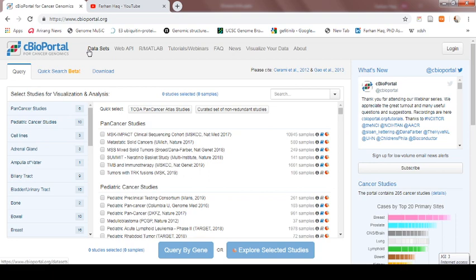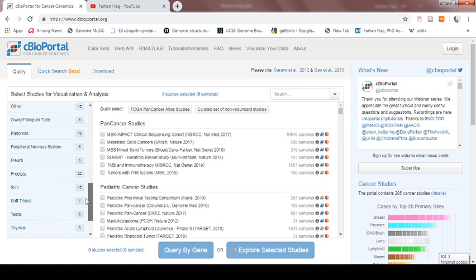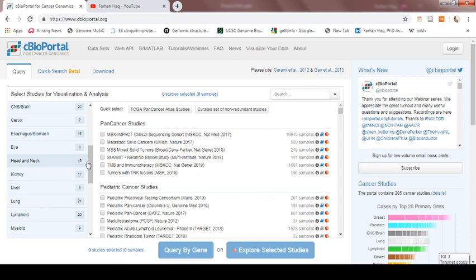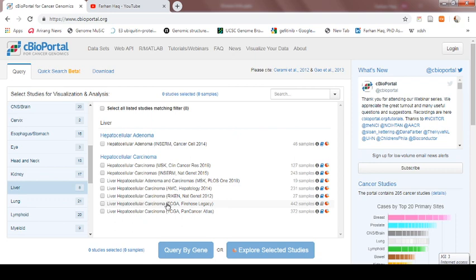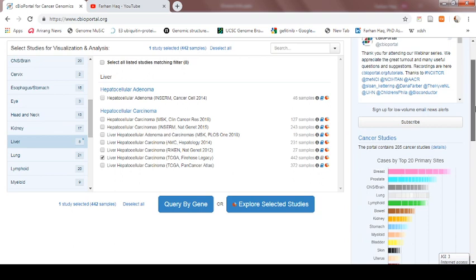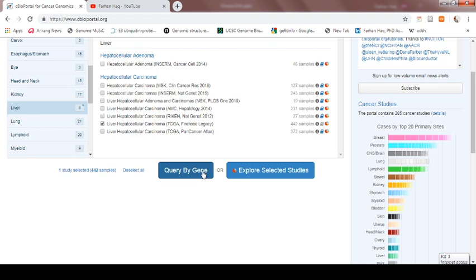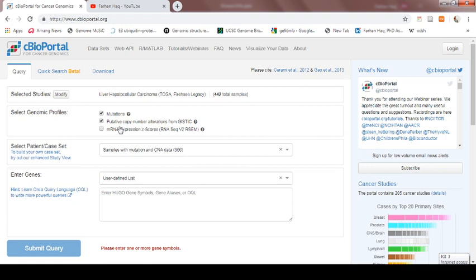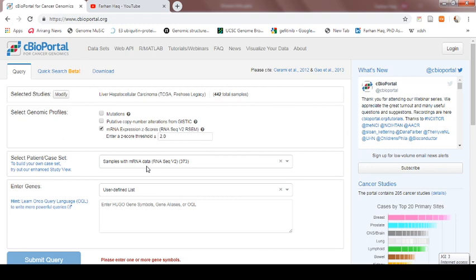You can see that in cBioPortal there are a lot of different datasets, which I have already explained in my previous lecture. Just to make it consistent, we will directly go to liver cancer because the question we have raised is associated with liver cancer. To make it more consistent from previous lectures, we will again select the same cancer type — liver hepatocellular carcinoma. After selecting this cancer type, we will select the expression. The total number of samples with mRNA expression data of RNA sequencing is 373.